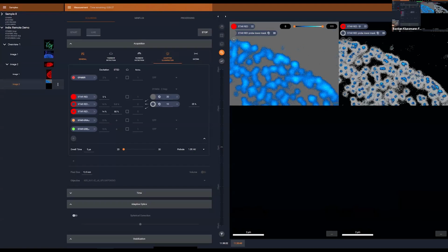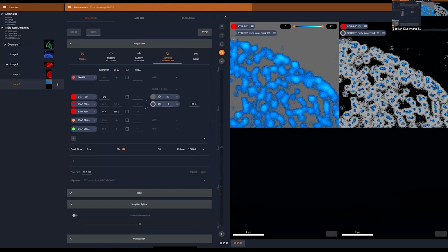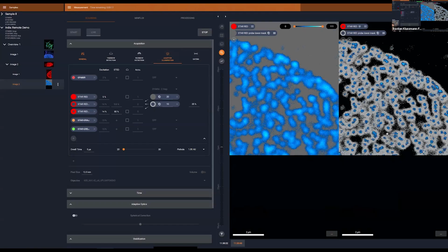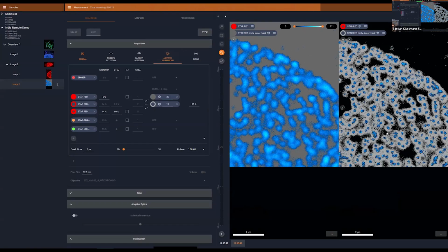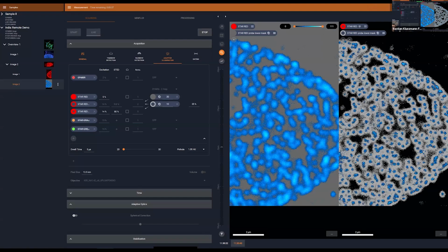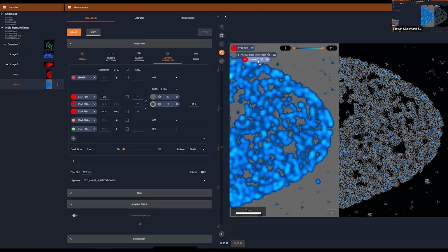And then we see this brighter gray mask, where we refine our illumination mask by an intermediate low power STED and can increase or like minimize the illumination we put on our sample quite significantly. Give it a second. Okay, now it's done. So I can go to my processing window here again, the deconvolution.